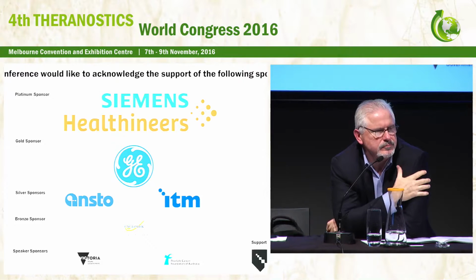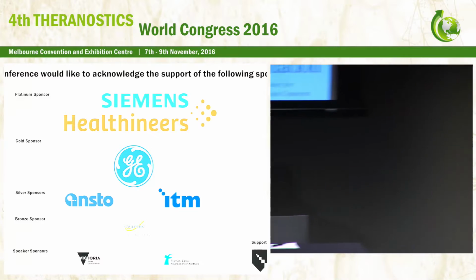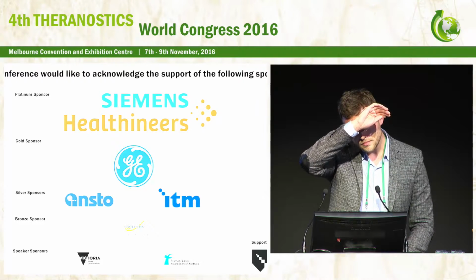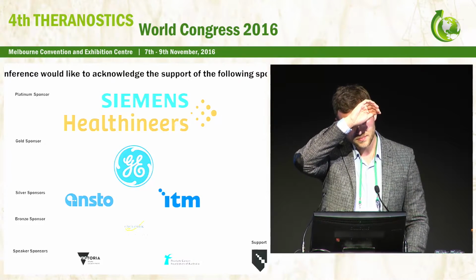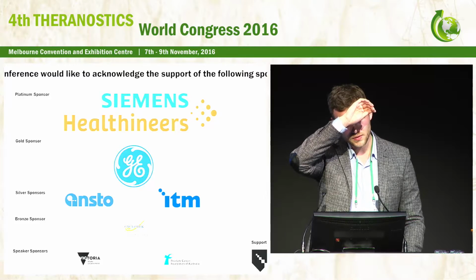Question? Hi, very nice and very useful presentation. I have a comment rather than a question. To avoid surprises, you have to validate your HPLC method. A very important part of that validation is the control of the recovery of the column. So before using any HPLC method, you have to perform those experiments and show that nothing is getting stuck on your system or on your column, and whatever you get on your chromatogram corresponds to reality.